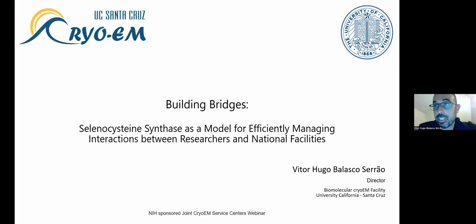Today's talk, as Omar introduced, covers 2 different perspectives. First, how a screening facility in a local institution can greatly help the progress of people who don't have access to screening microscopes, because the screening facility is quite important to do the hard lifting and to understand how your sample behaves. I chose the Selenocysteine Synthase, also called SelA, as an example because, as Omar also said, I have a deep relationship with this molecule that I'm going to explain along my talk.